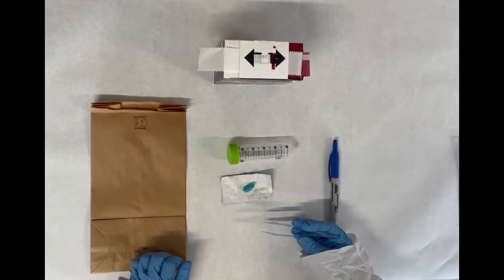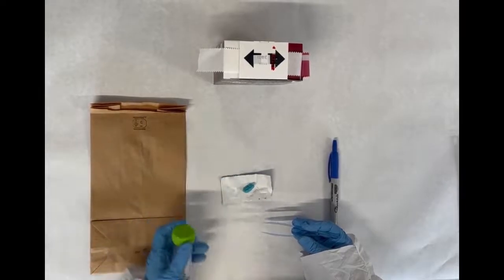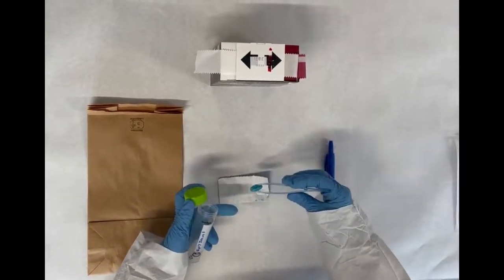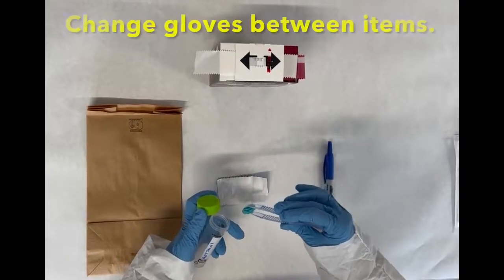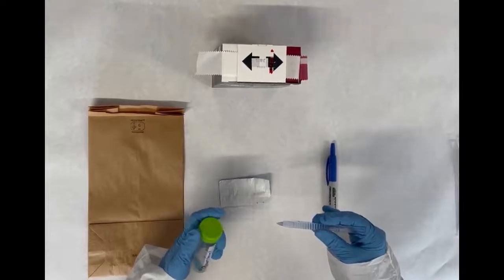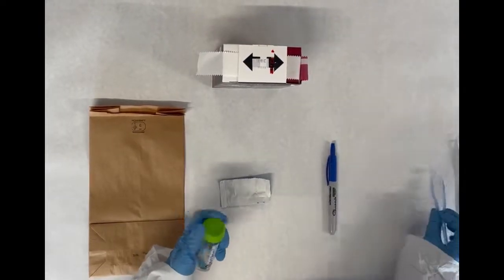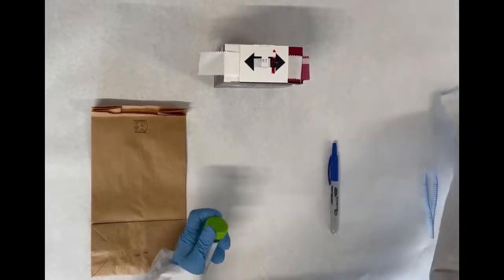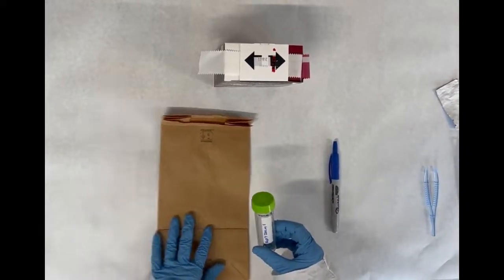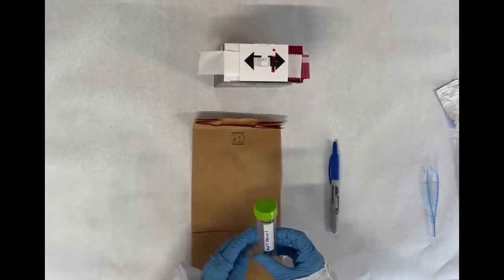If your gum is still tacky and pliable, as ours is, you want to take a sterile tube, remove the cap, and using sterile tweezers or your gloved hand, pick it up and place the gum into the tube. Avoid rolling or pressing the gum in on itself. Then cap the tube. You may place a piece of evidence tape over the top of the tube if you wish, but it is not necessary.